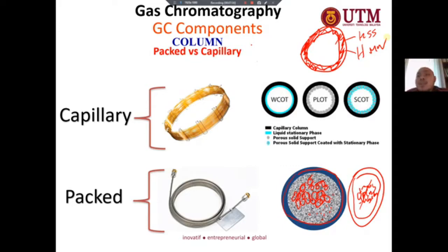But the problem is that, with wall coated in the early days, they could only apply a very thin layer of coating.